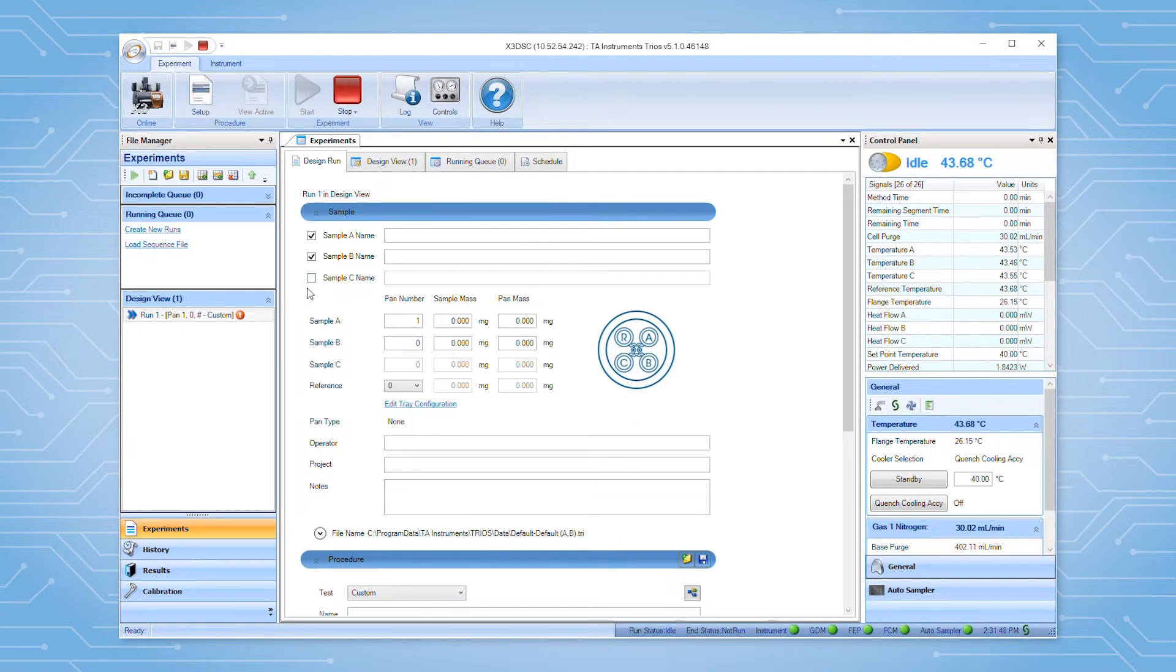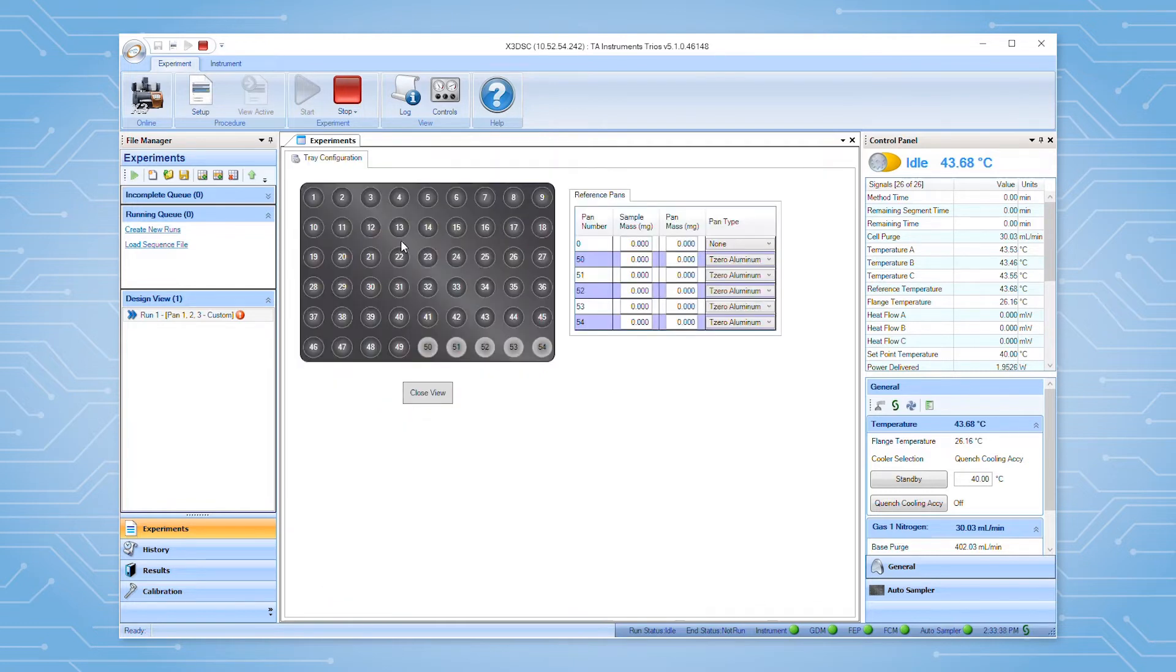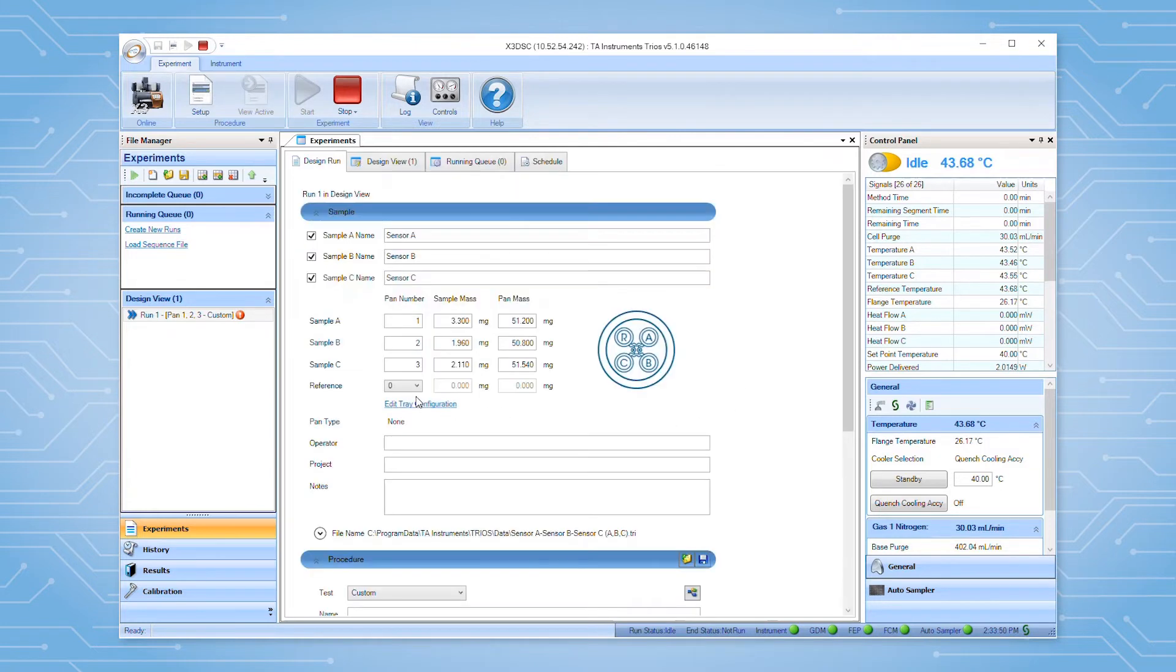Next, enter the sample names and pan information into the corresponding fields. Click the edit tray configuration link to set the correct reference pan information. Once complete, click the close button to be taken back to the experiment form.